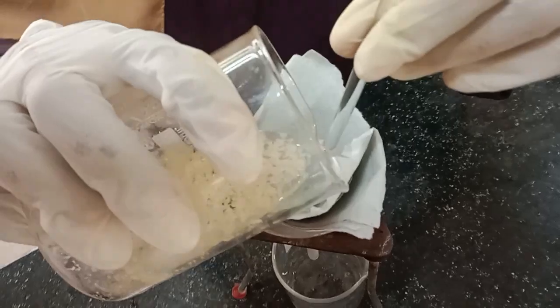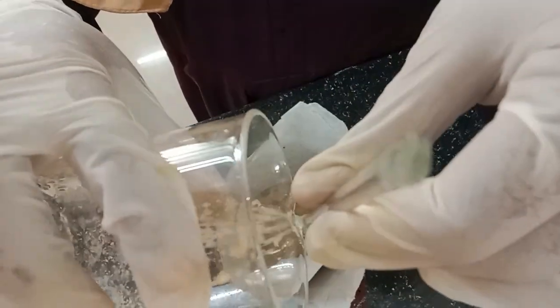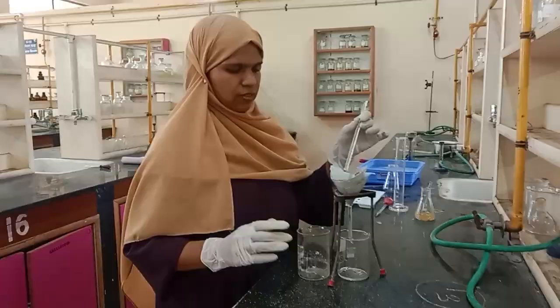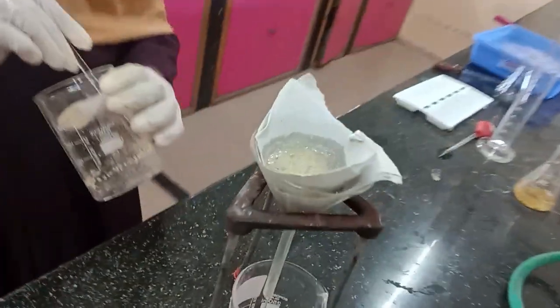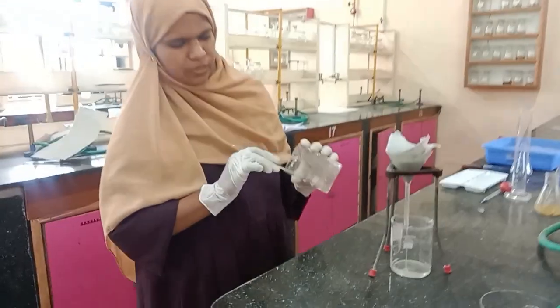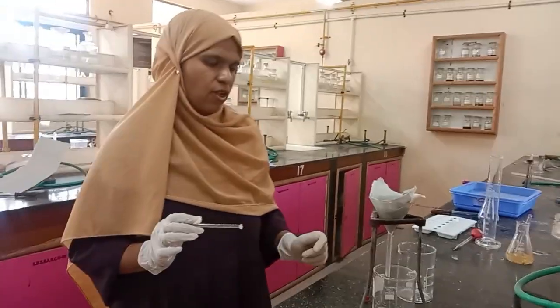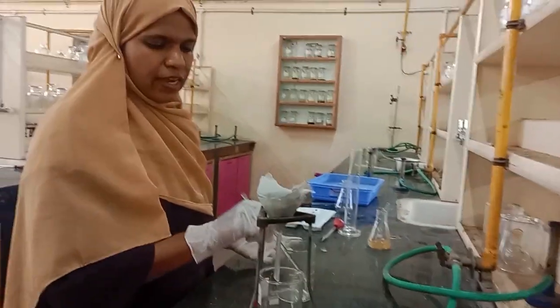Now filter these crystals. After the filtration is complete, recrystallize from ethanol. If necessary, you can recrystallize from ethanol. After drying, record the yield, melting point and TLC.